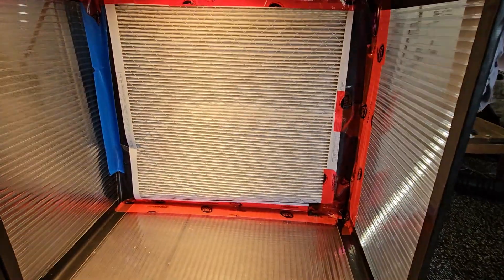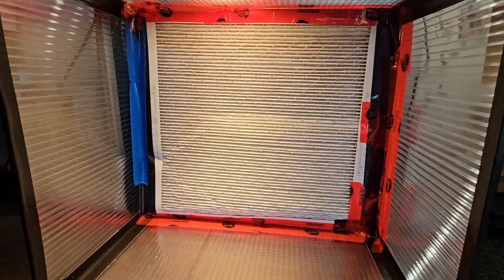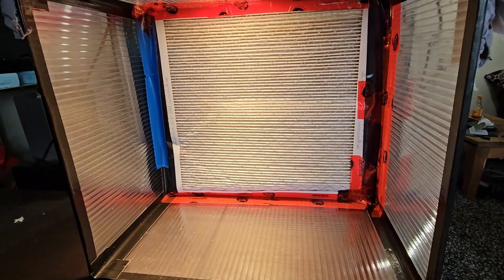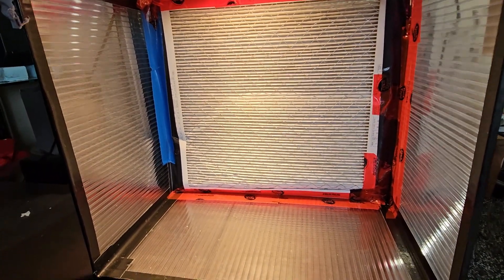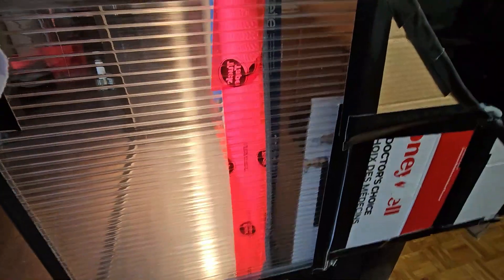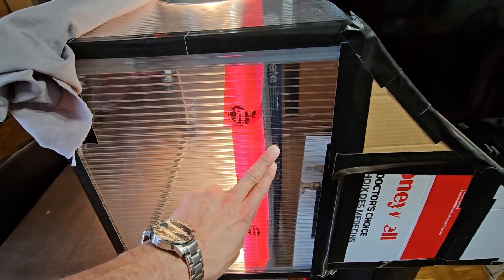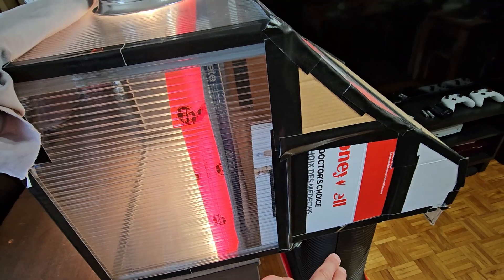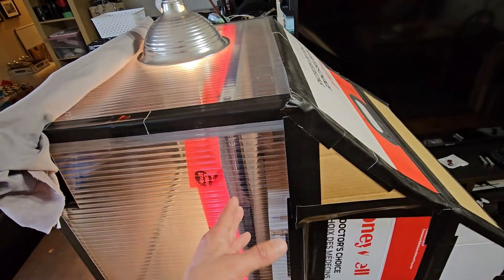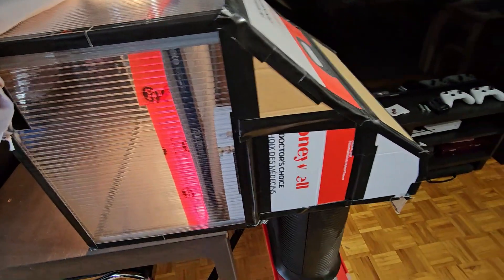I have a pre-filter in here — this is just a 20 by 20, or a 24 by 24, 3-micron furnace filter, just a cheap furnace filter from Home Depot. I've got it installed about this far back so that the air filter pumps air up, it collects in this cavity, then backs up behind this filter and comes through evenly.